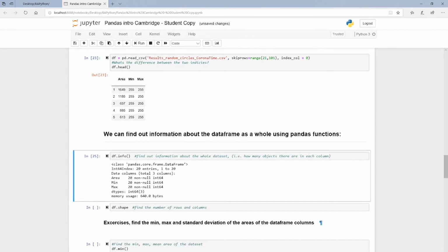That's important because maybe if we have one entry that doesn't work or didn't come in, then this might be 20, 19, 20. And that'd be important to know when you're looking at your data just to make sure that you verify that everything is there that should be there. You might miss one if you've got a 10,000 entry data set, and this says 10,000 non-null, this says 9,999 non-null, and this says 10,000 non-null.